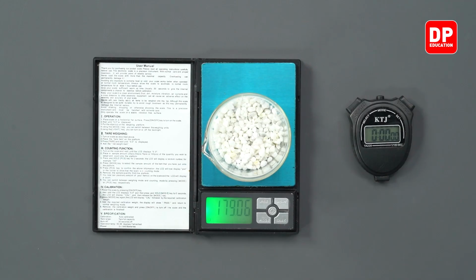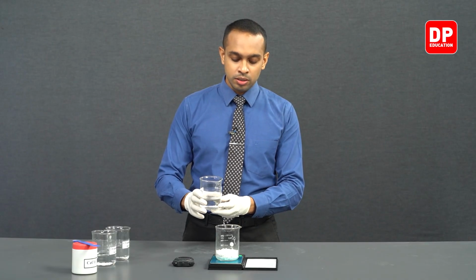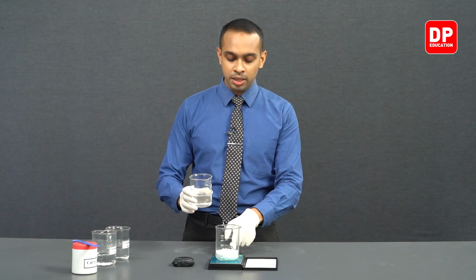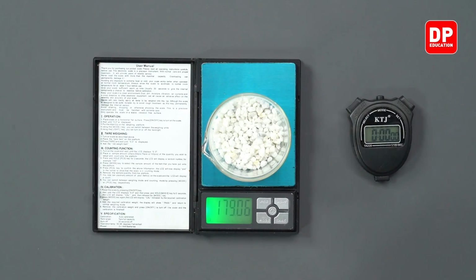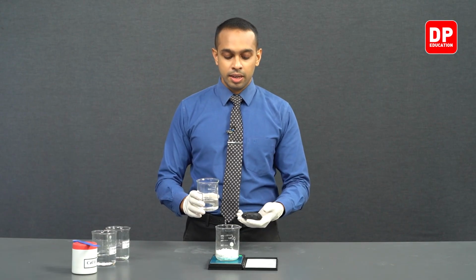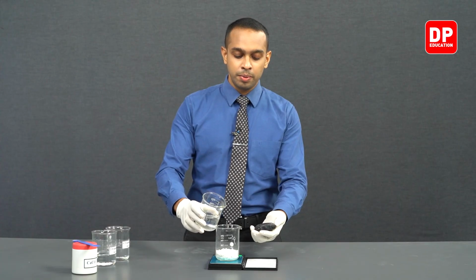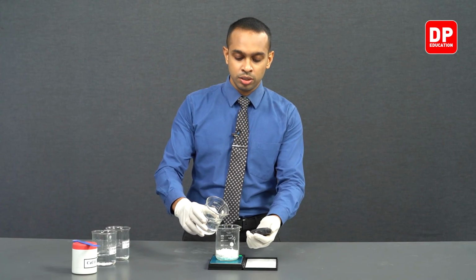Now students, we are going to add 1 mole per decimeter cube HCl to this. You can see the mass reading is 179.06, and as we add the HCl, we will be turning on our stopwatch.